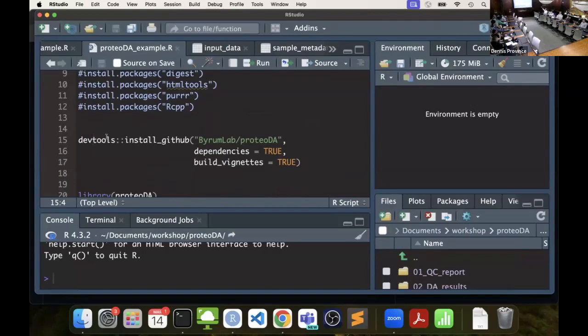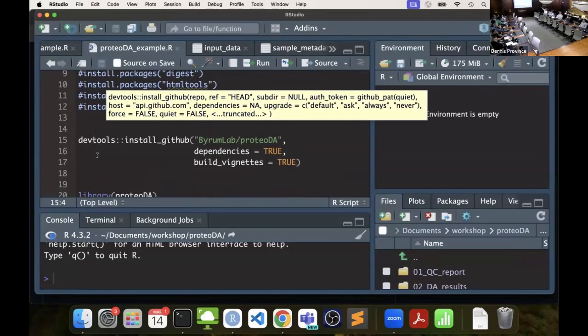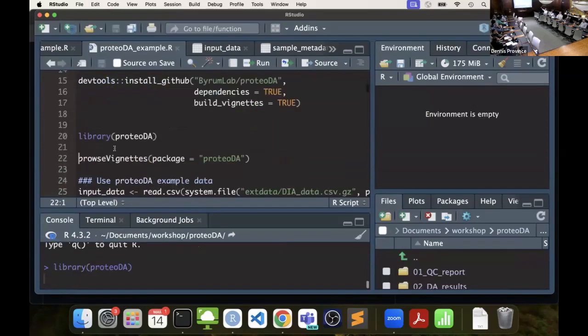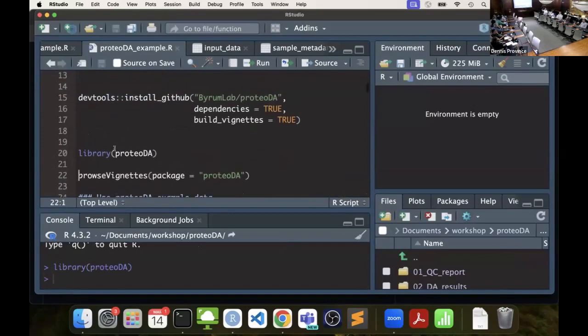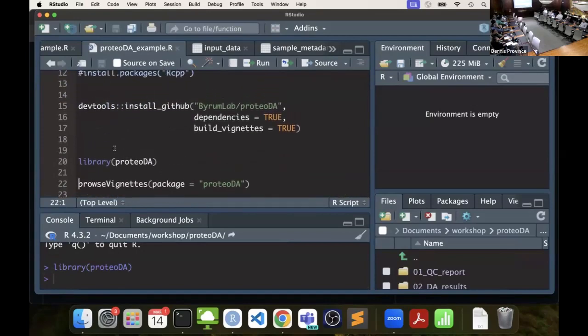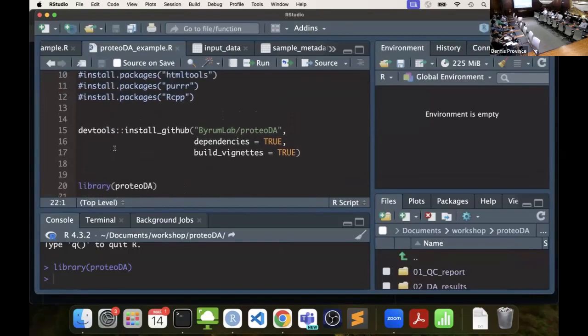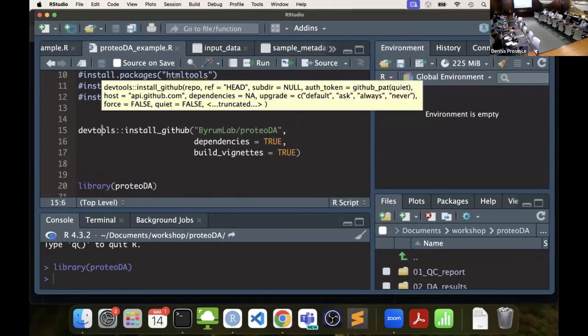And all the lines that have the hashtags, those are comments. Yep. That's where I had to start, because I kept seeing her do this hocus pocus, and I was like, I don't know what she's doing. Because we do this every day, you just turn it on and do it. Yeah.